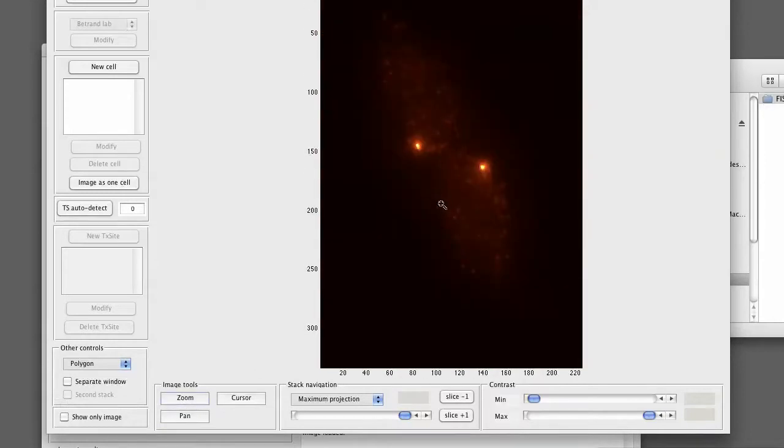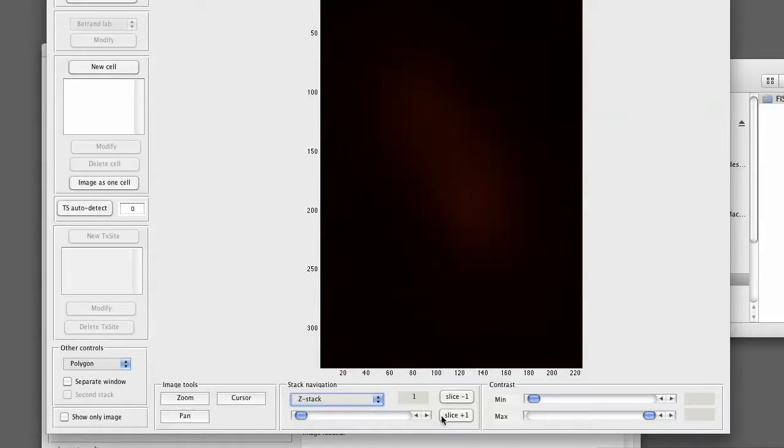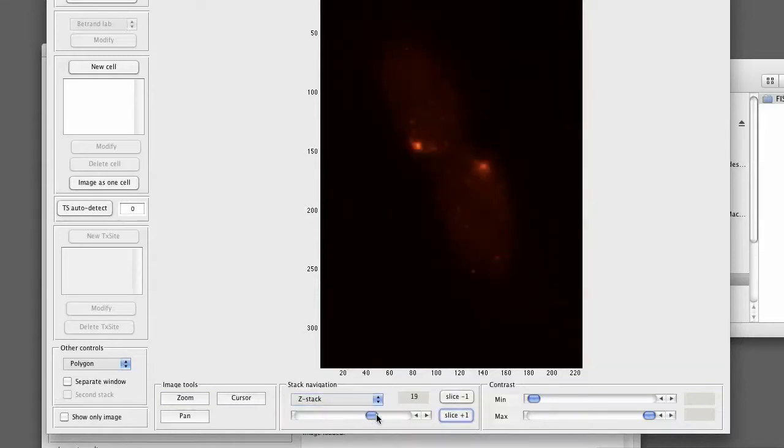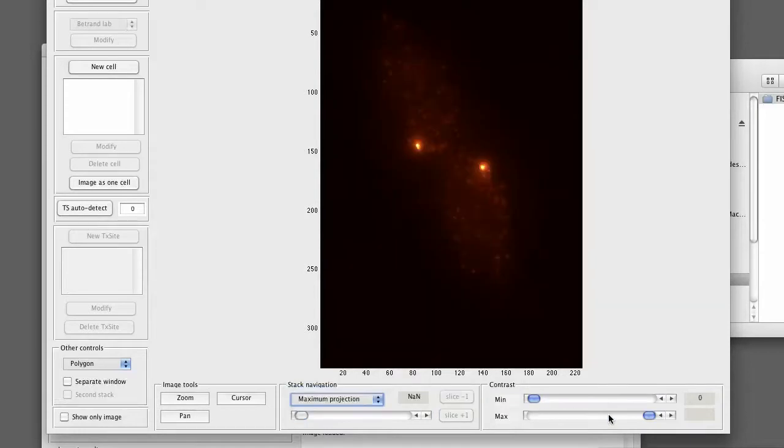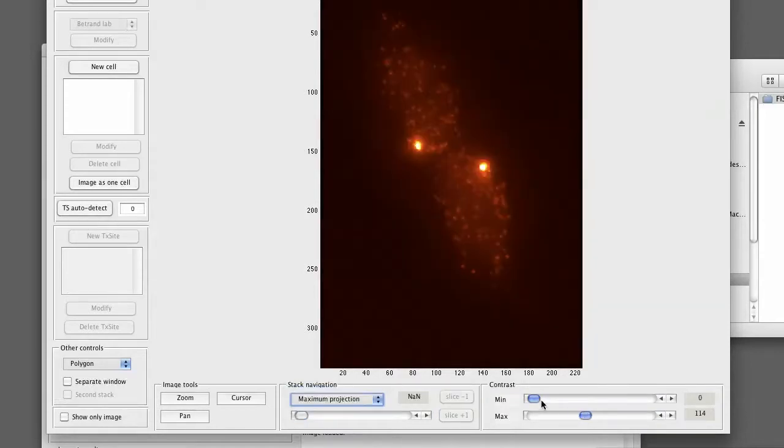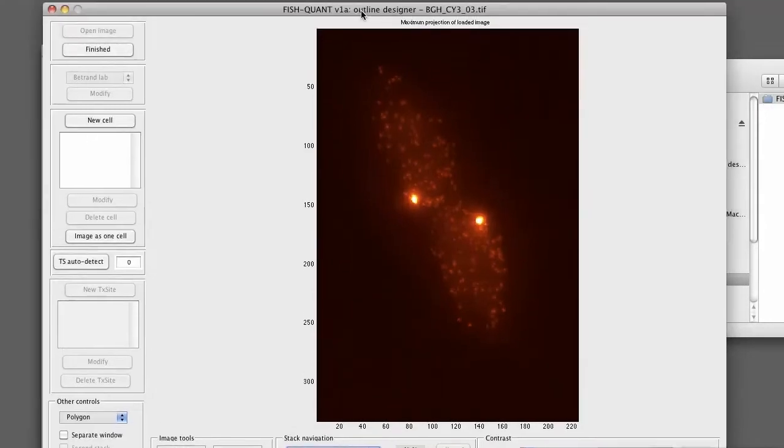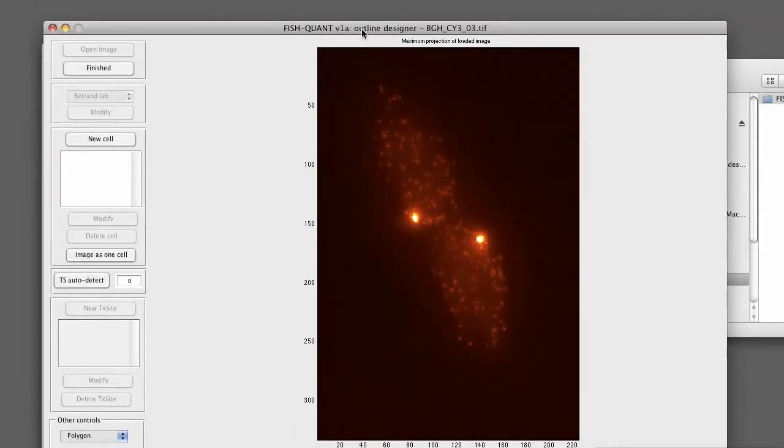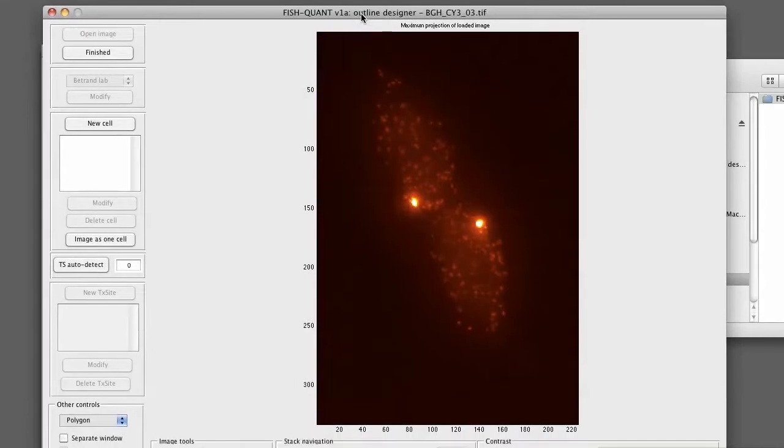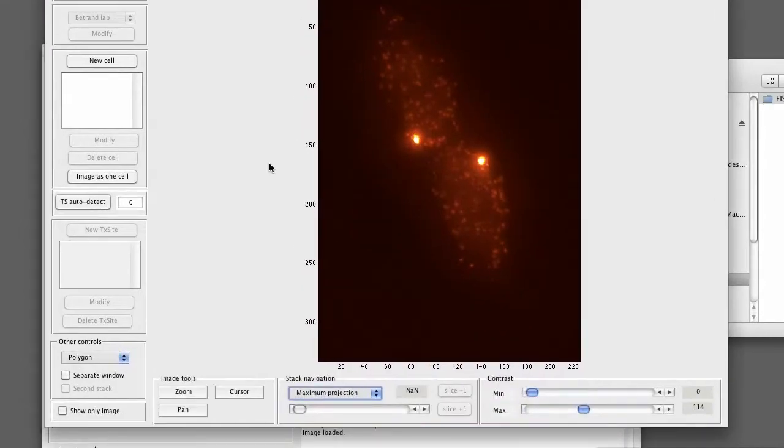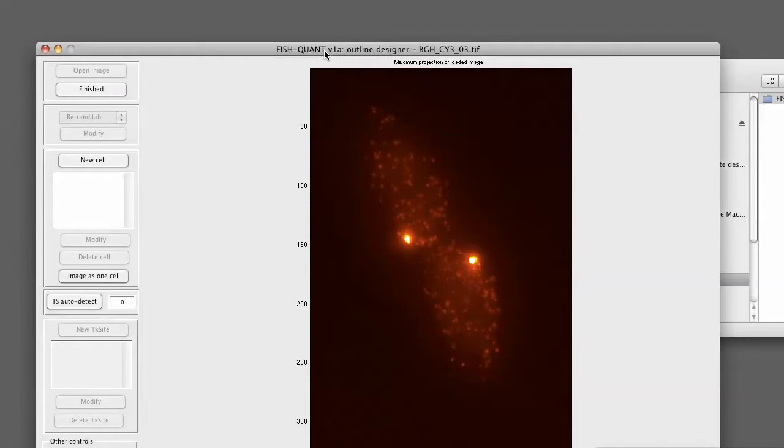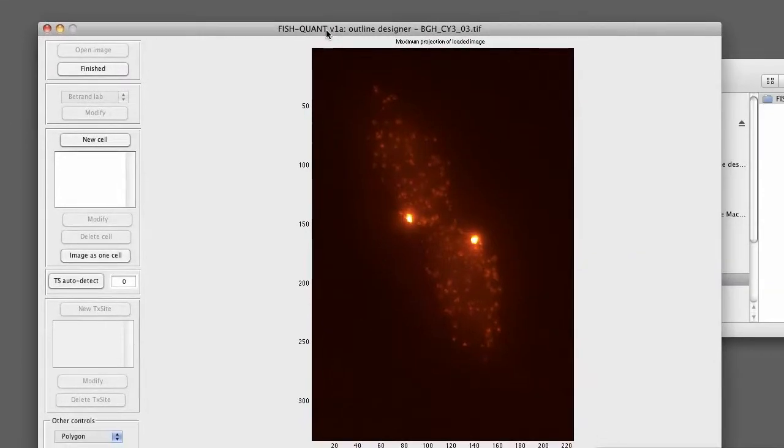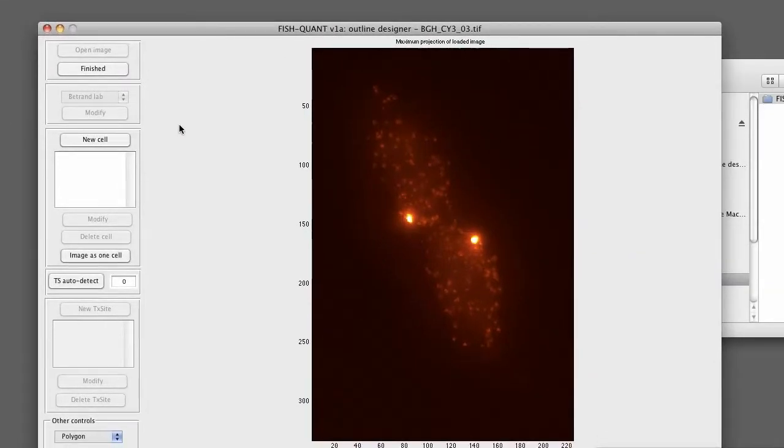Now we move out again. We can show the stack either as a maximum intensity projection as it's shown right now or we show it as a Z-stack and here we can move through the Z-stack. We can also change the contrast of the image, the minimum and the maximum. There are a number of other options. Loading a second stack, a DAPI image for instance, they are described in detail in the user manual. So we now want to start outlining ourselves.